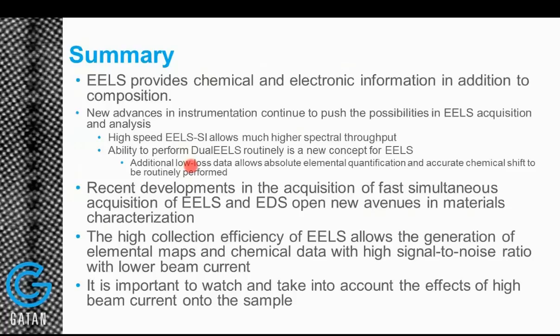In my opinion, it's very important to acquire EELS and EDS simultaneously. And the possibility that we have now in DigitalMicrograph to acquire fast EELS and EDS in hardware synchronization mode is definitely opening new avenues in materials characterization. The other important point is that the high collection efficiency of EELS allows the generation of elemental maps and chemical data with a good signal-to-noise ratio and with lower beam current. So take into account the effect of beam current. Don't throw too much current on your sample. You will destroy it. The results that you will get will not be accurate and reliable.